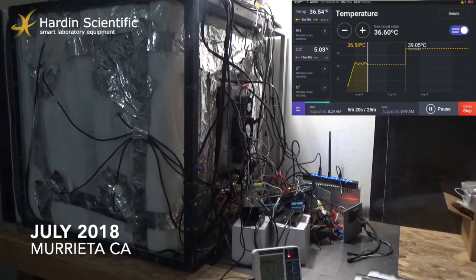So let's see on the temperature module. As you can see, we have some waves, right? Just a little bit below, a little bit above the target, and the system is trying to make it happen, to keep the target at 36.6. Let's just see how it works.